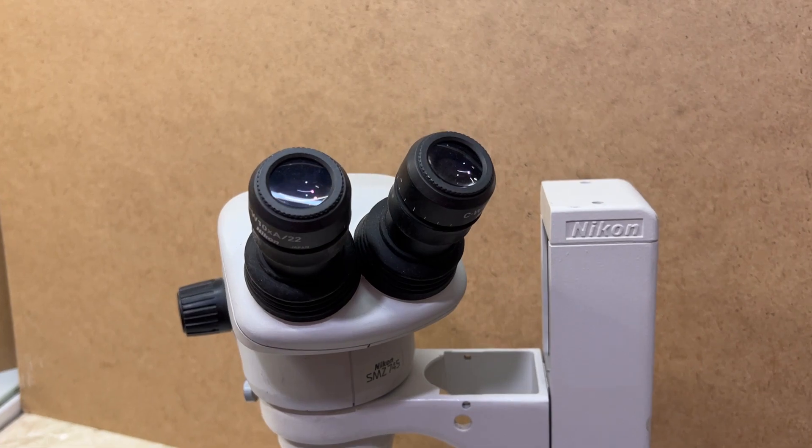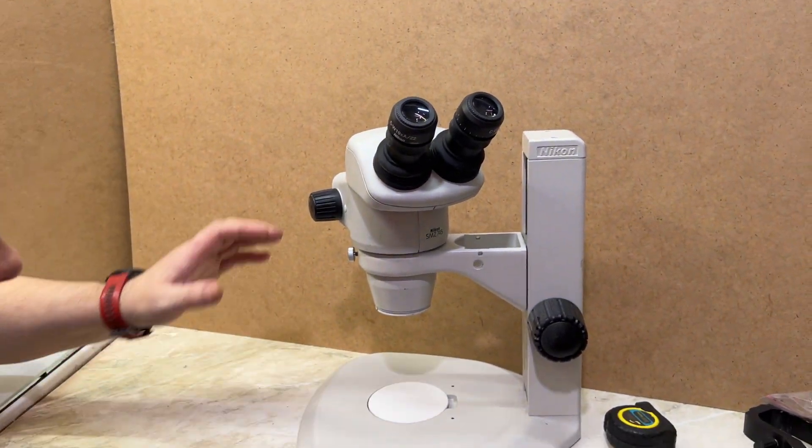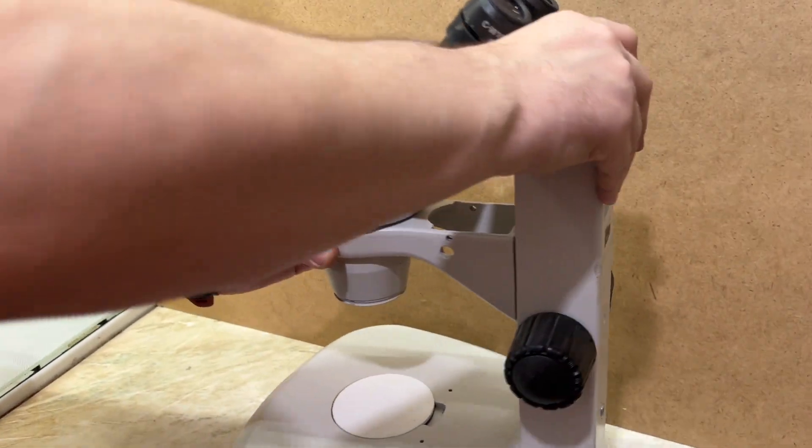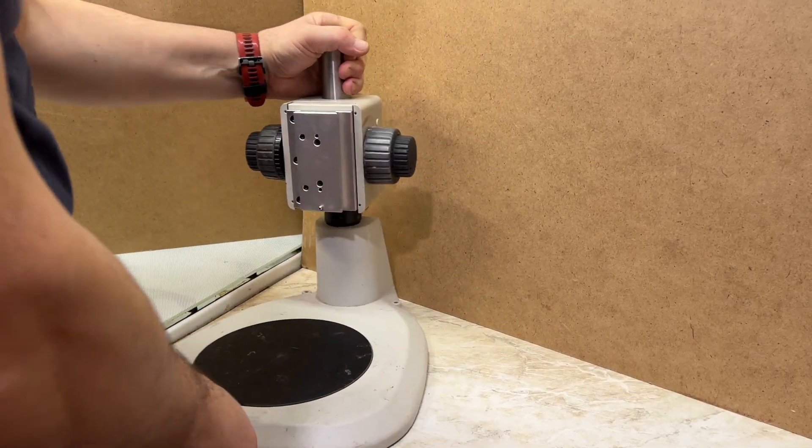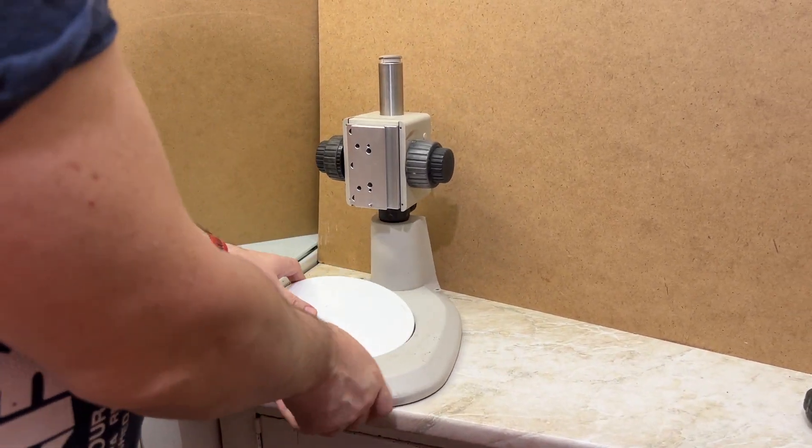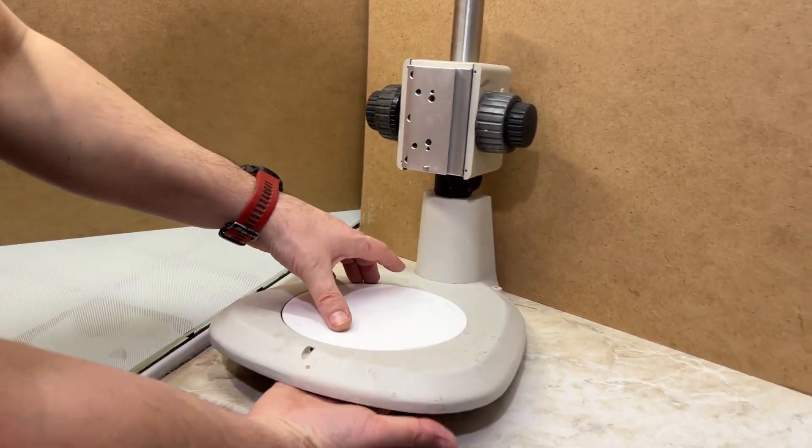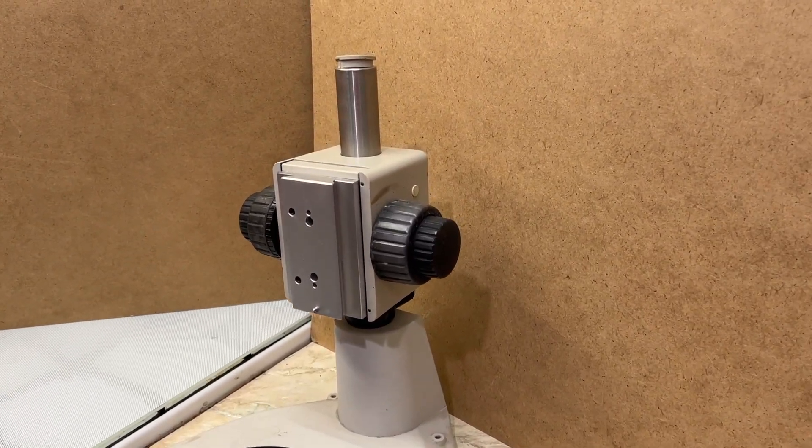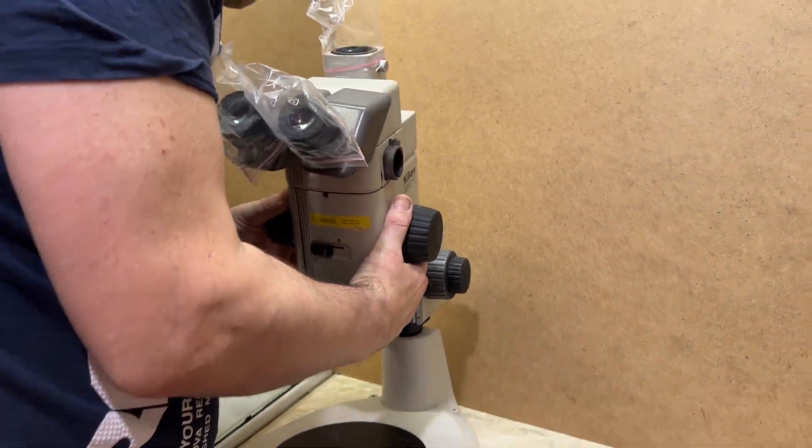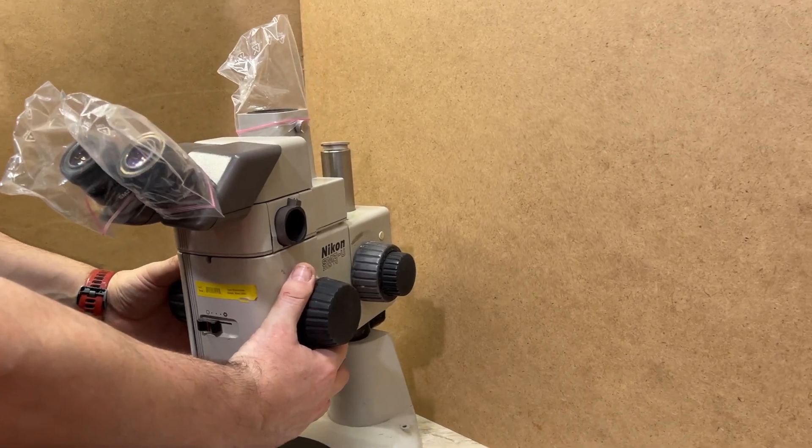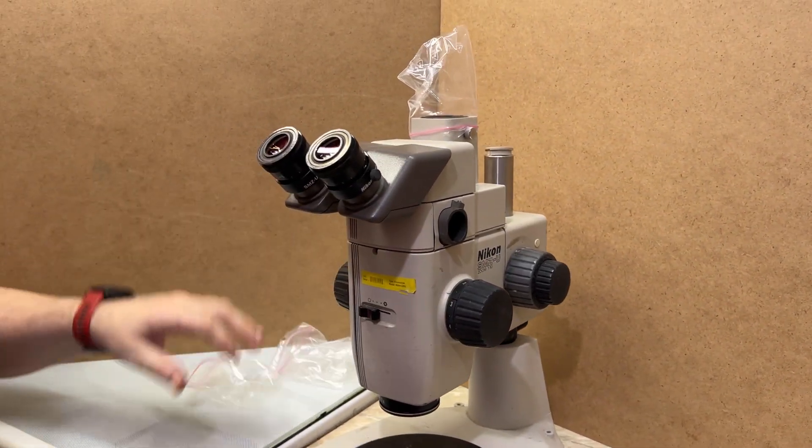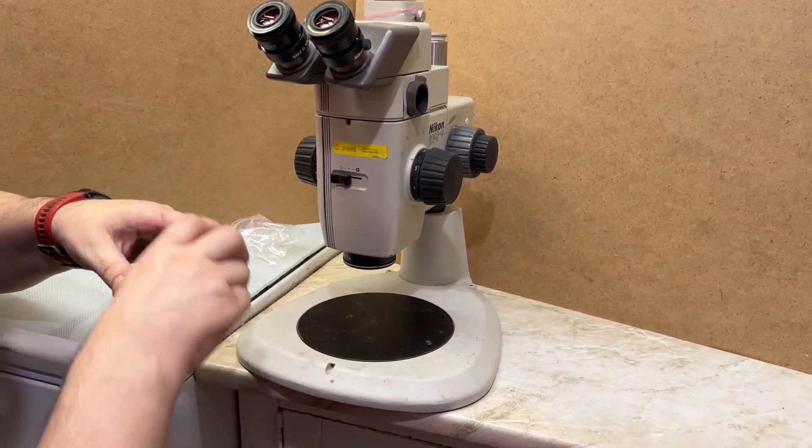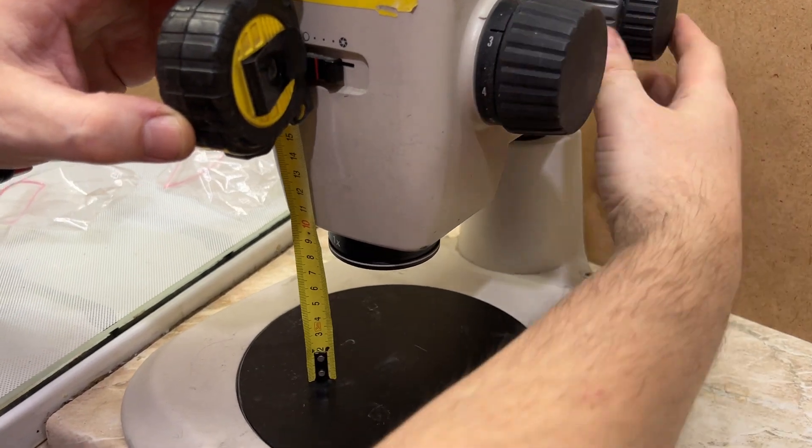Now let's make our final comparison. We need to see the star of this night: the Nikon SMZ-U with a little stand. Here's our stand, it's pretty compact. We can clip this plate with two different colors. When we connect our Nikon SMZ view, we can see our distances. I need to have about 82 millimeters here.